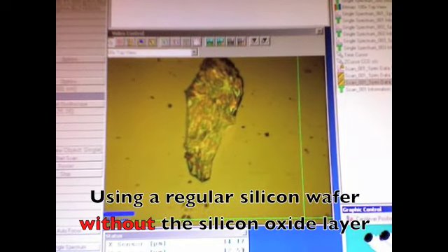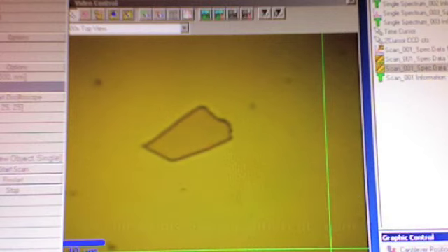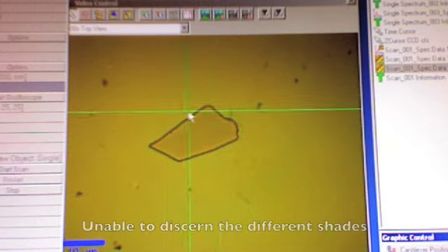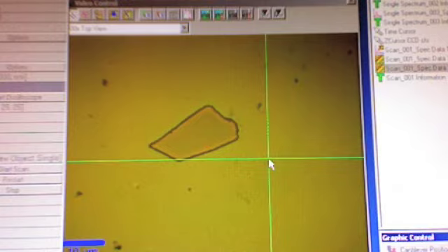Here we have repeated the experiment with a regular silicon wafer without a silicon oxide layer. As you can observe, you can no longer discern the different shades that distinguish single layers from multiple layers. Again, you can see that the sharp edges distinguish graphite flakes from tape residue.